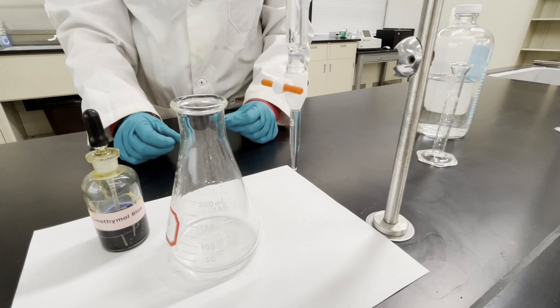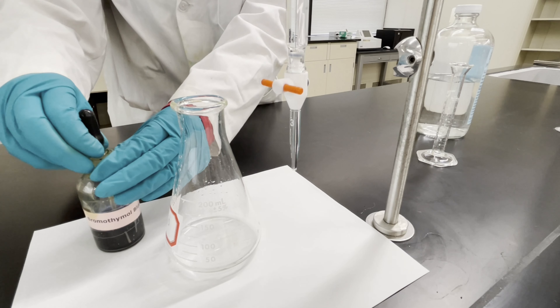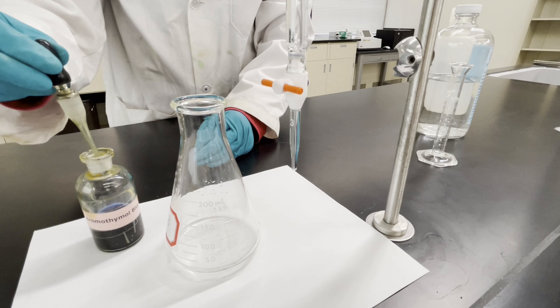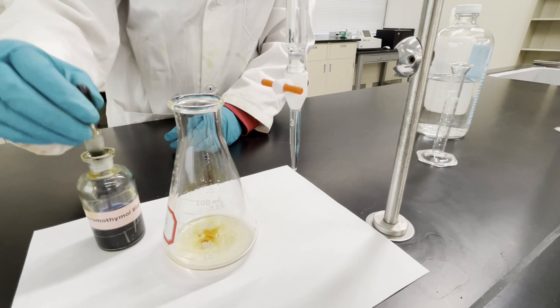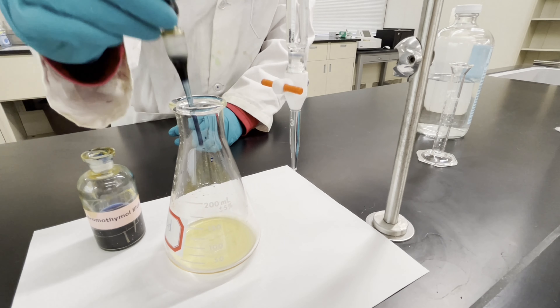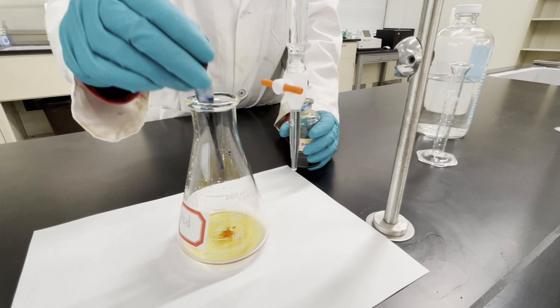Now I'm going to take some bromothymol blue indicator. This will let us know when our titration is done. I'll take a couple drops and give it a swirl until we have a nice yellow color. This will be our starting color.